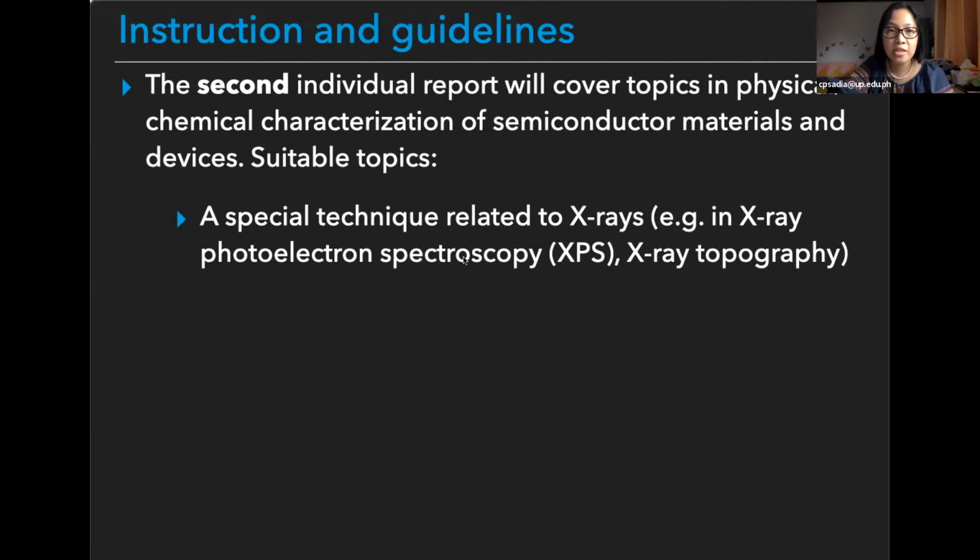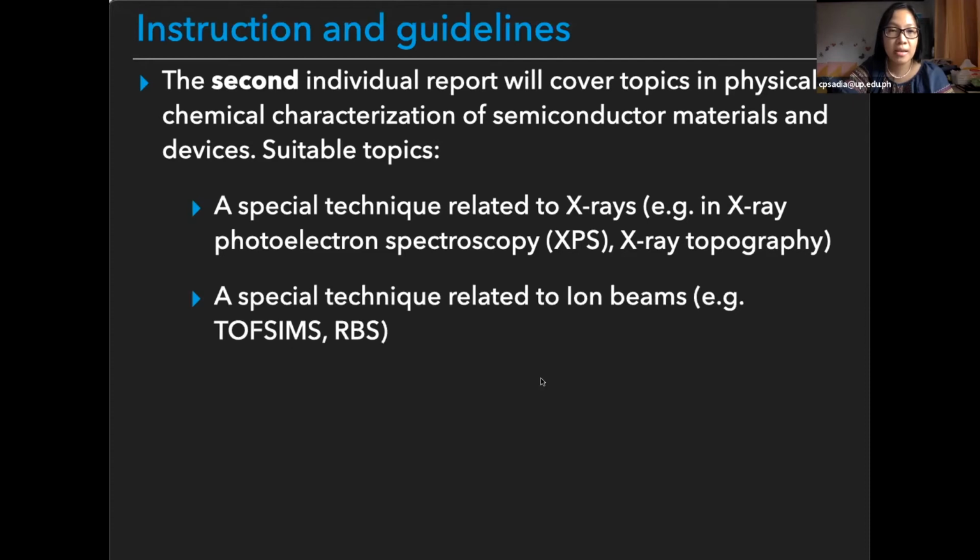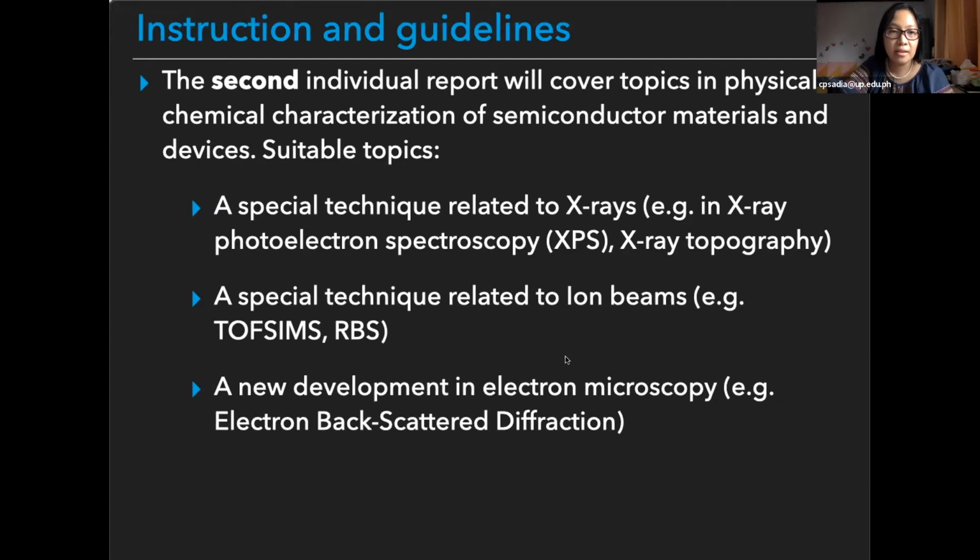Number one, a special technique related to X-rays, such as X-ray photoelectron spectroscopy or XPS and X-ray topography. Another is a special technique related to ion beams, such as TOF-SIMS and Rutherford backscattering. And last but not least, a new development in electron microscopy, such as electron backscattered diffraction.